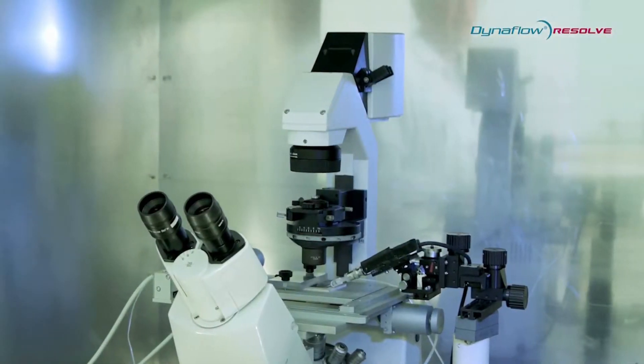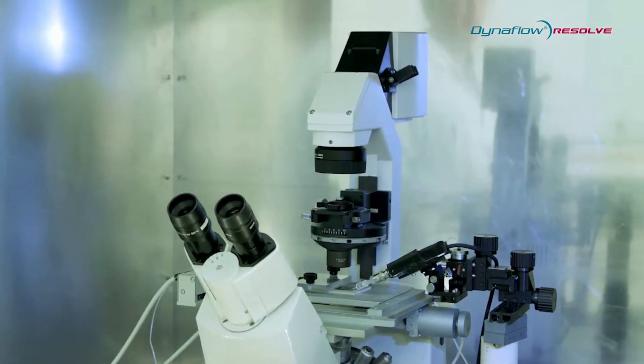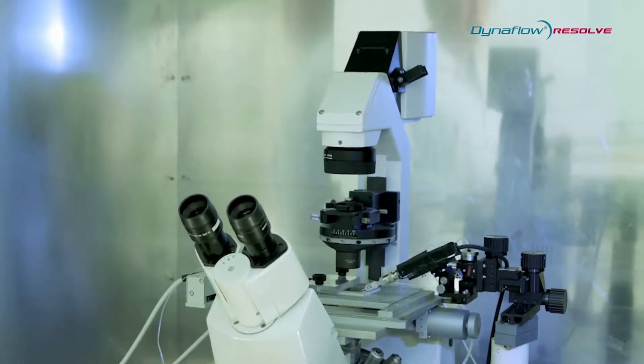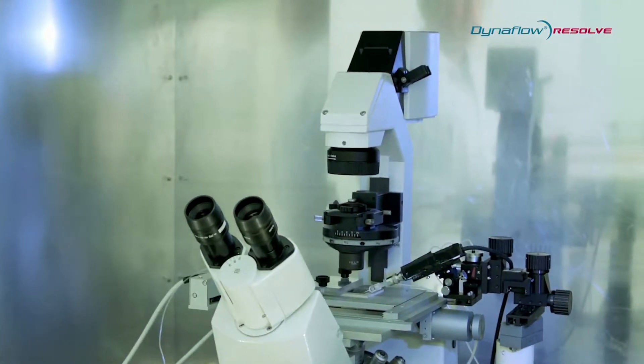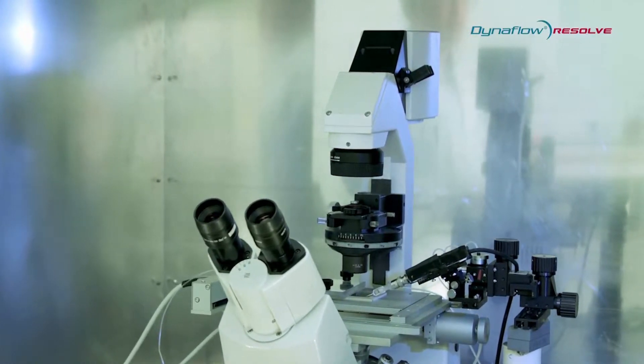I'd like to present the Dynaflow Resolve system for automated compound application in manual patch clamping. The Dynaflow Resolve system can be added to any existing patch clamp setup with an inverted microscope.